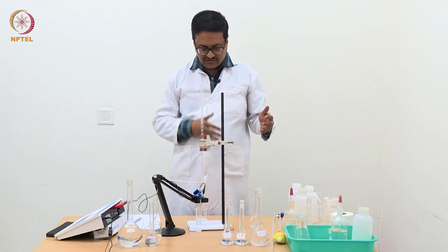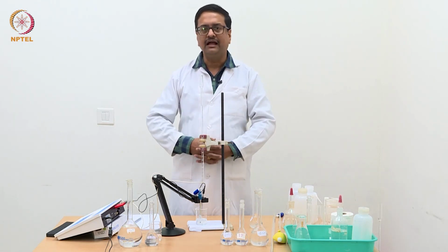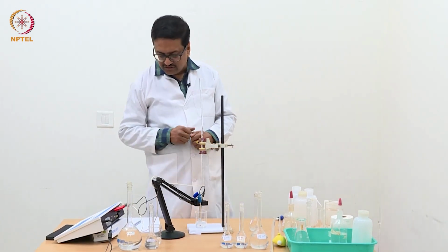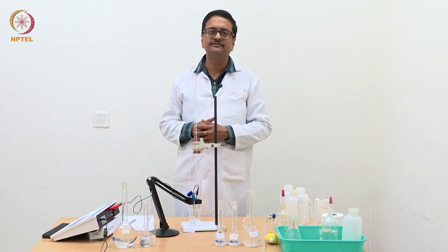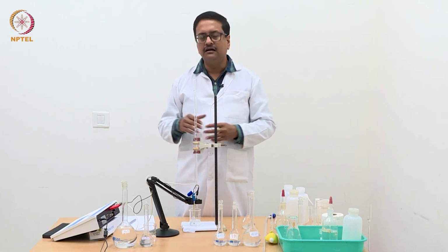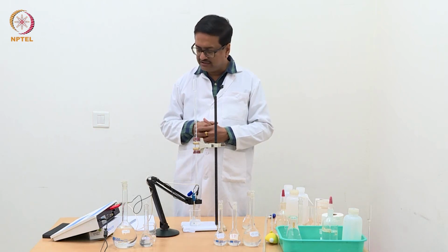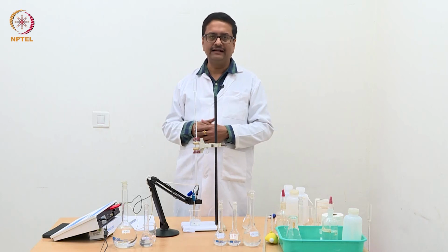So, chloride ion is removed as a silver chloride precipitate and is replaced by nitrate ion, which has very similar conductivity compared to chloride, and hence we will not see any significant change in conductance till we reach close to the end point. Beyond the end point, we will see that the conductance is increasing significantly because of more and more silver nitrate being added.